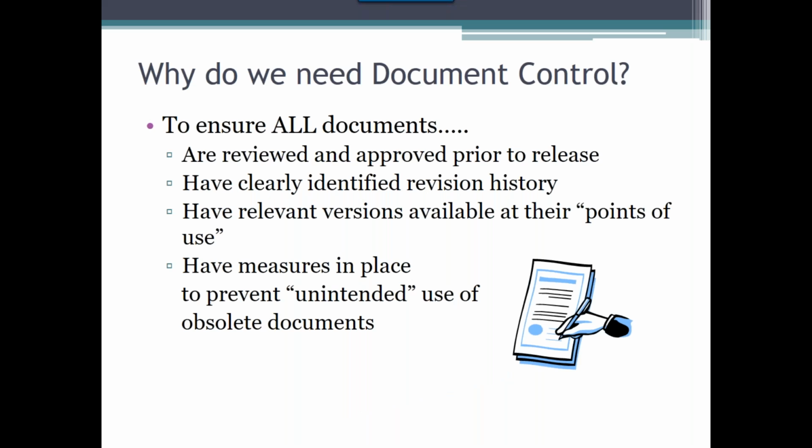So now we're going to move into the concept of document control. Document control can be a very involved process depending on how big your organization or system is and how many documents you have to control. Document control is a process that is exactly as it suggests. It is essentially a method of control of all document types in every stage of a document's life cycle.